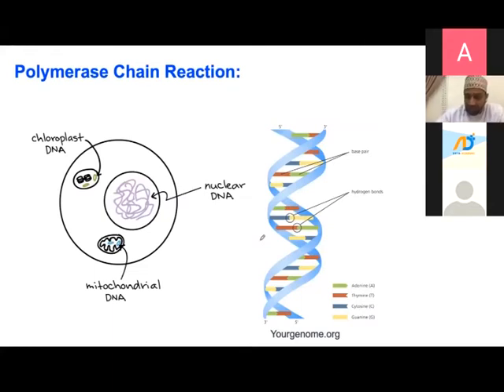Everything we're going to talk about today is basically on PCR, which is the polymerase chain reaction. PCR is just a molecular technique that you can use on nucleic acids, DNA and also RNA. And it works on a double-strand molecule, so you need to have 2 strands of the molecule to work with PCR. And you can use nuclear DNA, for example from blood or tissues. People who work in the hospital can even get paraffin blocks from the pathology lab and extract DNA. That DNA will not be fully intact, but still you can use PCR on that DNA and it can work for you.